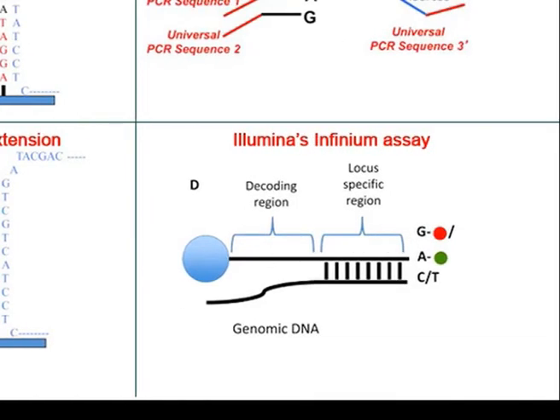Allelic discrimination by hybridization suffers background due to non-specific hybridization in complex genomes. In order to reduce this background, Affymetrix developed a PCR based approach to reduce the genomic complexity. SNPs are selected for their assay to be between restriction sites that are less than 1 kb apart. Genomic DNA is fragmented with a restriction enzyme, end repaired, and adapters for PCR are ligated to the fragments. PCR is performed under conditions that selectively amplify products of less than 1 kb in size.